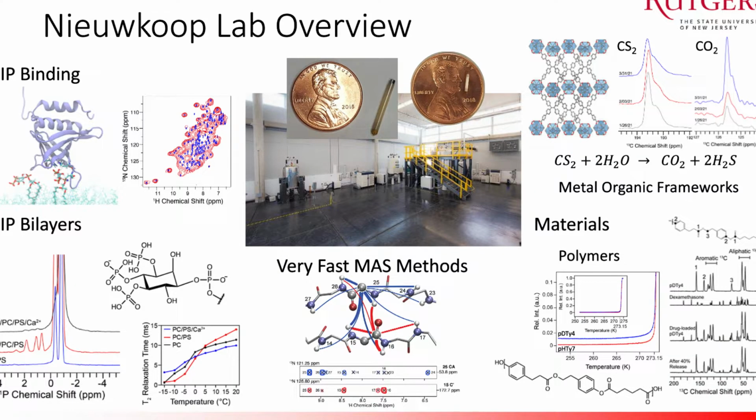All right, so that was kind of the PIP bilayers portion of the talk. I want to move on now and talk a little bit about the proteins. We have some NMR data there, like I showed you, and then there's also a lot of computational work as a result of the close proximity of Dave Case and the global pandemic that didn't allow us in the wet lab for quite a while.